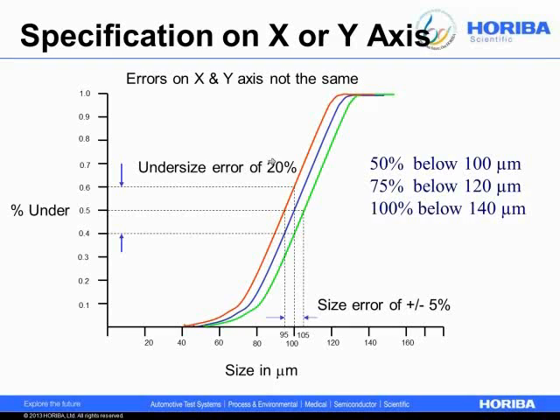And the takeaway for this slide should be you need to understand not just that measuring particle size is important and that it's something you should do, but you need to understand, is it the size itself that's important? Is it the median itself, or is it the amount of fine materials I have, or is it the absence or presence of large materials? Because that'll help you decide if you need to set your specification by size or by percent finer than.